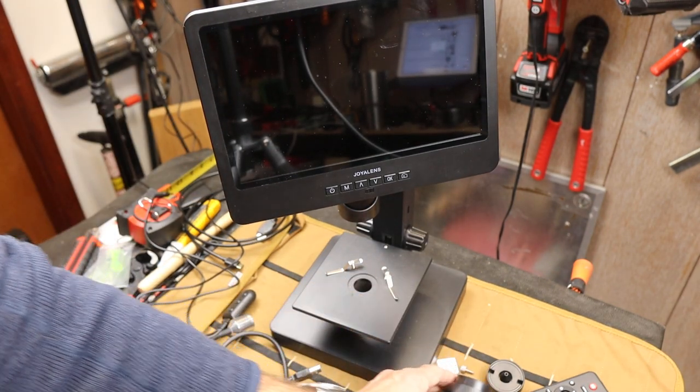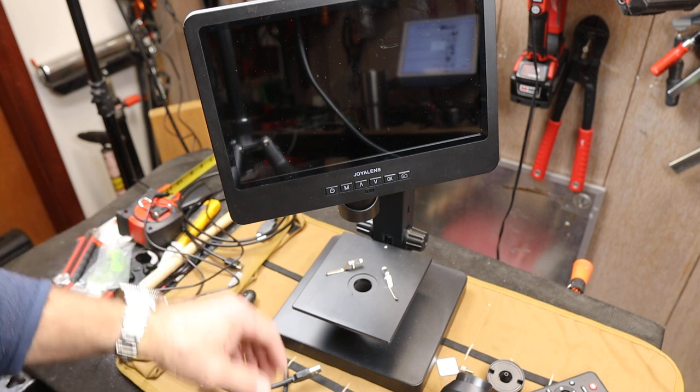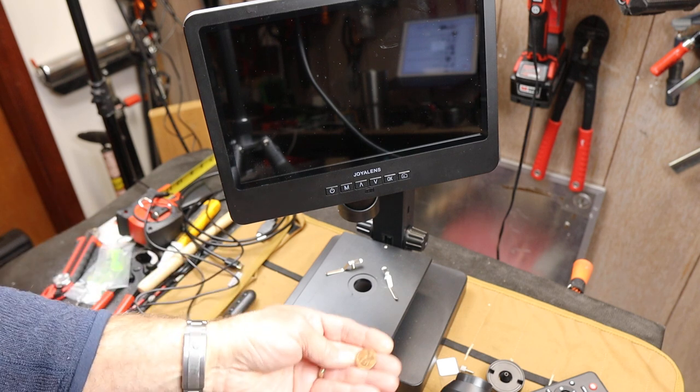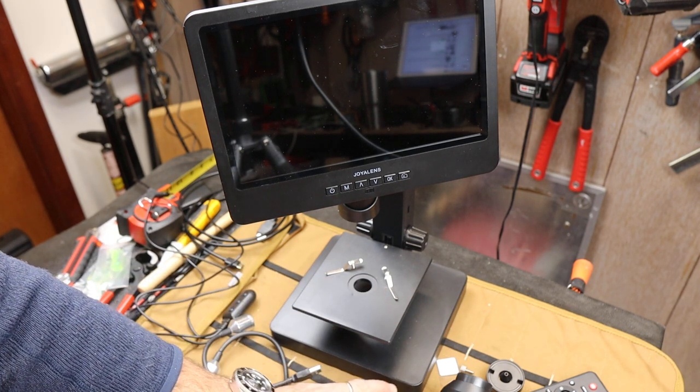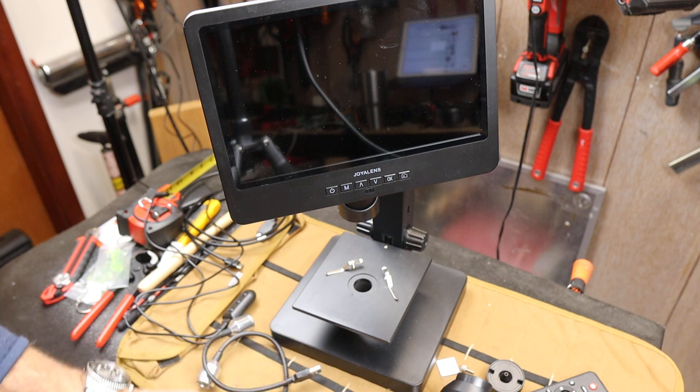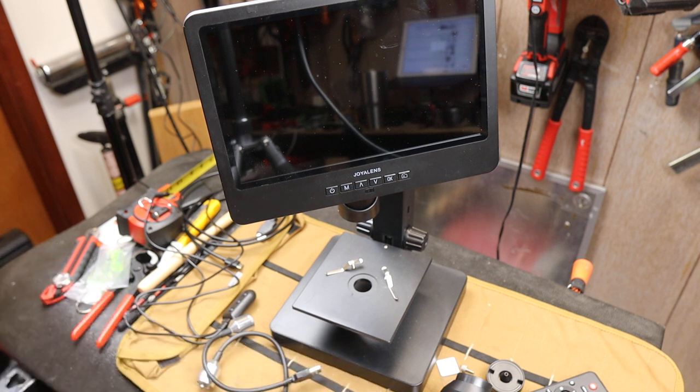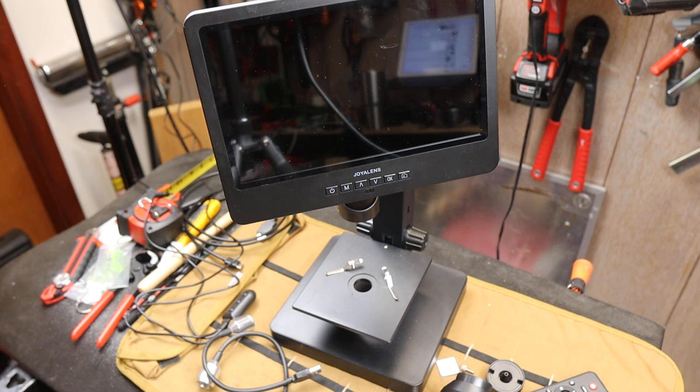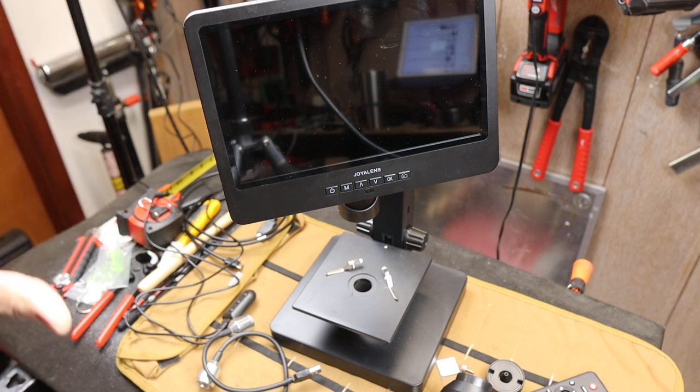So this is the Joya lens. It's a pretty amazing microscope. I mean, the more you play around with the small stuff, especially on the lower power, just looking at different things. I use it with knife blades, with tools, of course with coins, and a lot of minerals. And it's just wild to be able to play around with something this powerful, yet this simple.